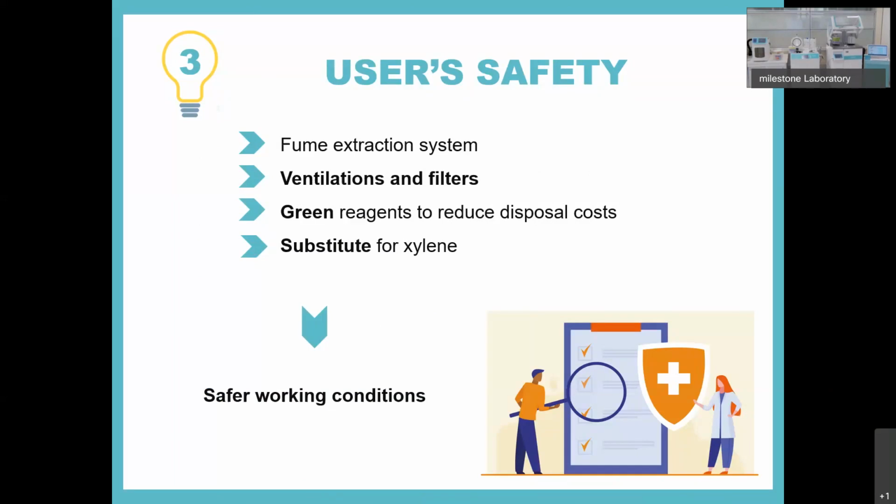I would also like to stress that the use of green reagents can have a significant impact on reducing disposal costs. Another suggestion is to use isopropanol as a substitute for xylene. In this way, we will significantly extend the life of the wax.